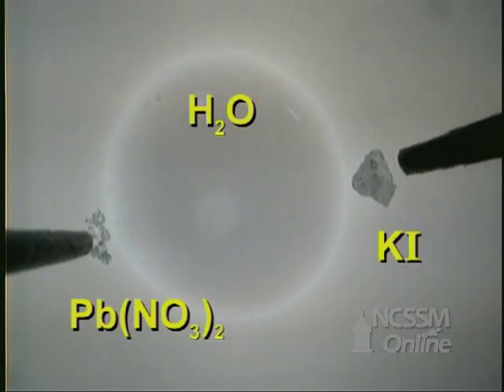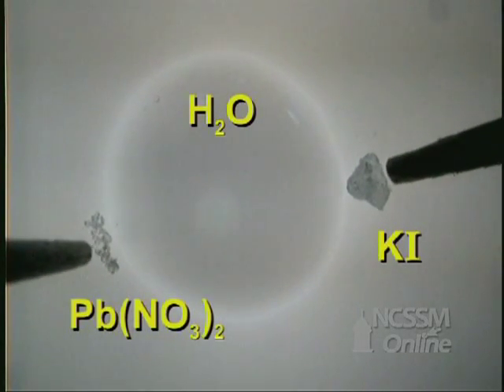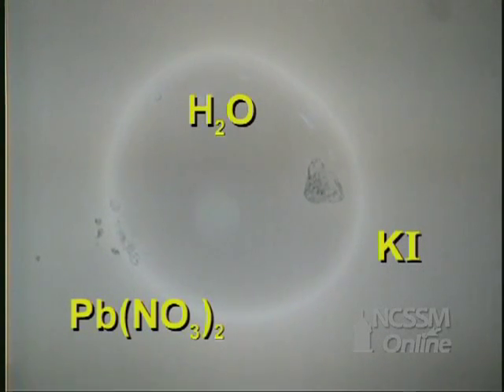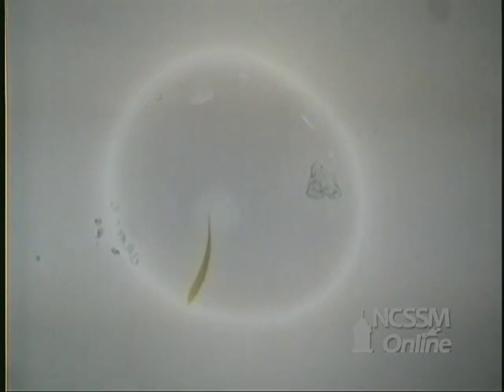To get a closer look at a double displacement reaction, we will use a microscope camera to see the reaction between lead nitrate and potassium iodide. A drop of water is placed on a microscope slide and a crystal of each compound is placed on each side.